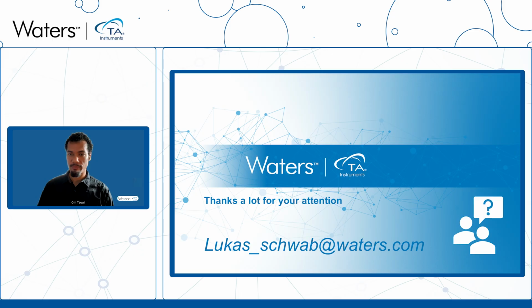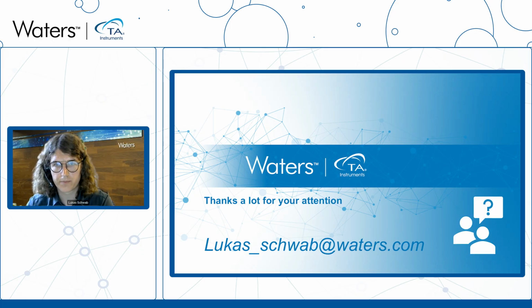Our first question is, what is the upper limit for temperature on this device? So the device is working with Peltier temperature control, so it works, I think, from 0 to 100 degrees. That's what I know off the top of my head, but it might even be a little bit higher. I need to check the exact numbers, but I think something like 0 to 100 degrees centigrade.